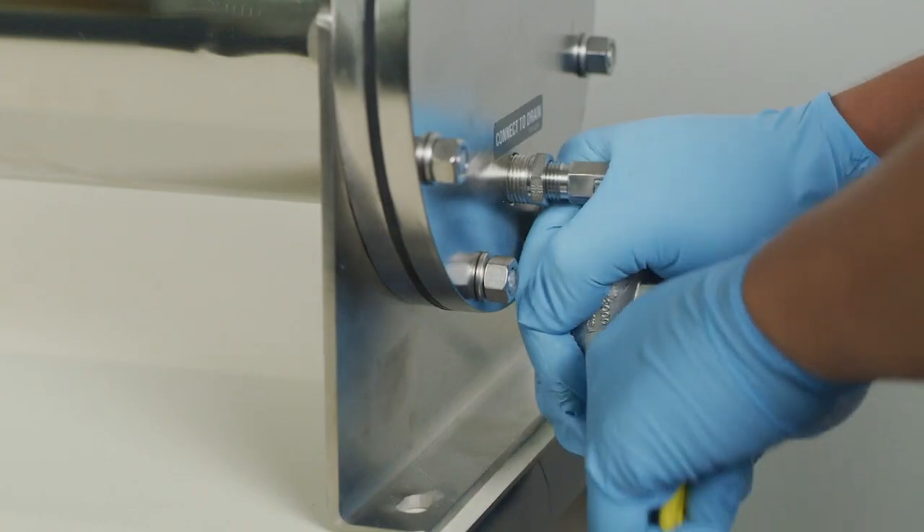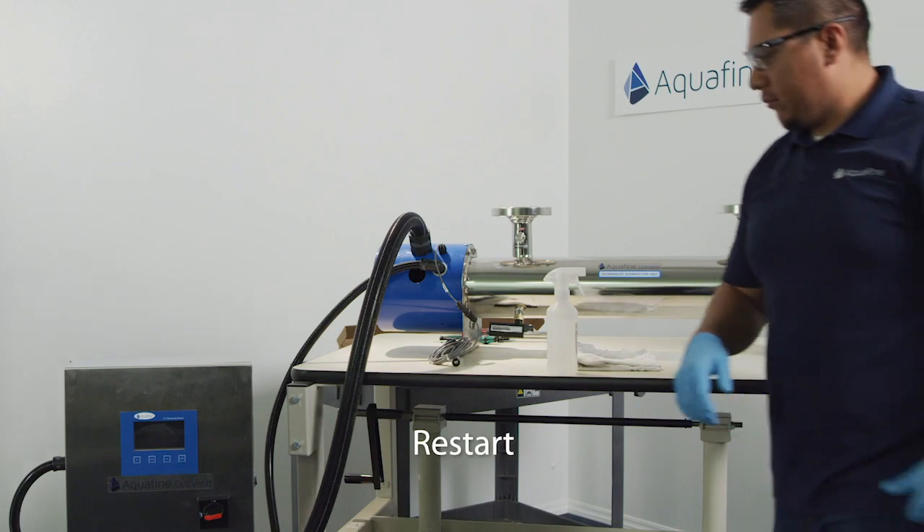Lastly, the drain and pressure relief valves can be closed. The unit can now be restarted.